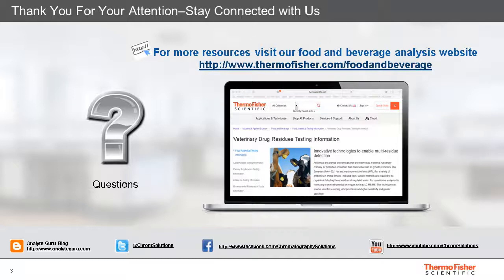Okay, thanks, Fausto. And this next question is for Richard. You gave some numbers of injections on the column, but is there any other evidence to show the robustness of ion chromatography columns? Yeah, this is a very important point. The Dionex anion exchange resin technology has been developed over more than 40 years, and the column robustness is proven in many laboratories analyzing a very diverse range of matrices.